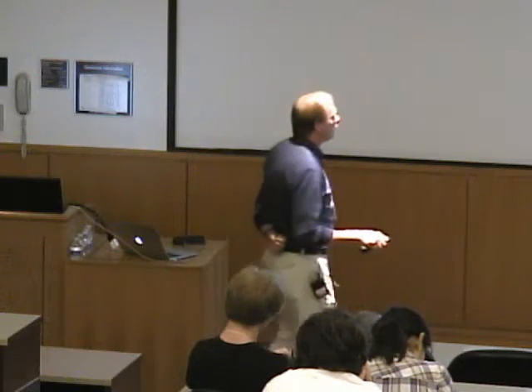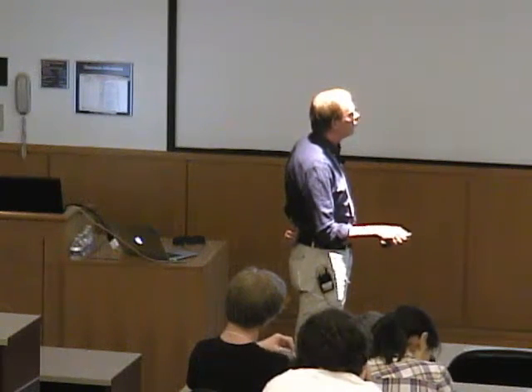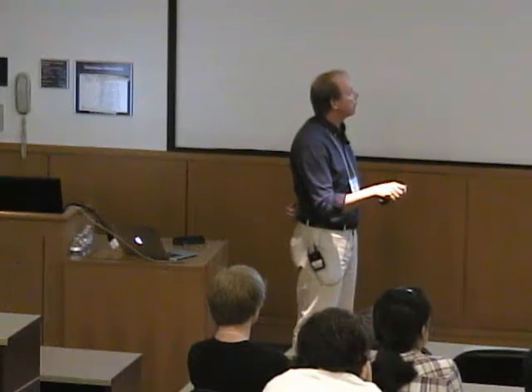So it means that the zero field splitting here, this energy gap, is much bigger than the interaction with the magnetic field, right? And so if we increase the magnetic field, these two levels, the plus minus a half levels, will split, and there will be some magnetic field value where we have a match of this energy gap with our microwave radiation. And then, on the other hand, the 3/2 levels will also split, but the slope of this line is larger than here because the value of ms is larger, right? And so there will also be another field position where this transition potentially can occur, right?